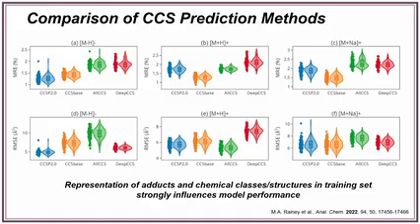And so this is a great resource, but it's just important to recognize that the algorithms and these machine learning methods are really going to perform best for things that they were trained on. So it's important if you're working on something that's maybe an unusual model system that might not be well annotated. Like I know I do stuff with bacteria. Their metabolites, their lipids may not be well represented in these training sets, and sometimes the adducts might not be there as well. So you might see higher errors in that sense. Just do a little bit of investigating yourself to make sure that you're picking something that's reasonable.